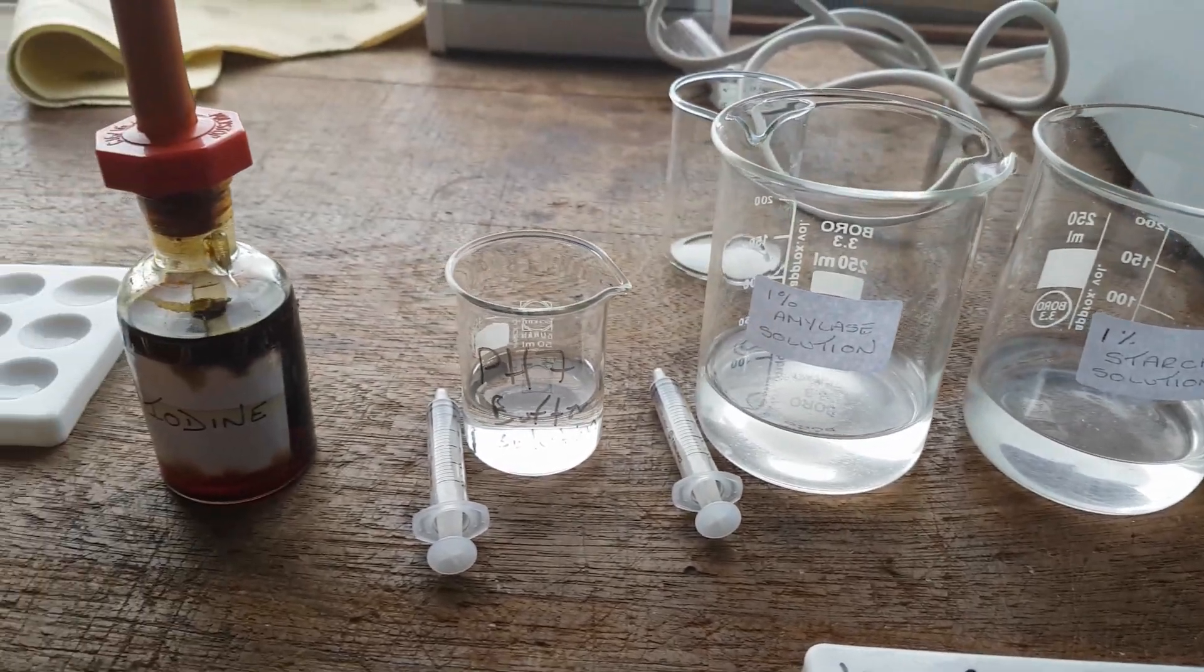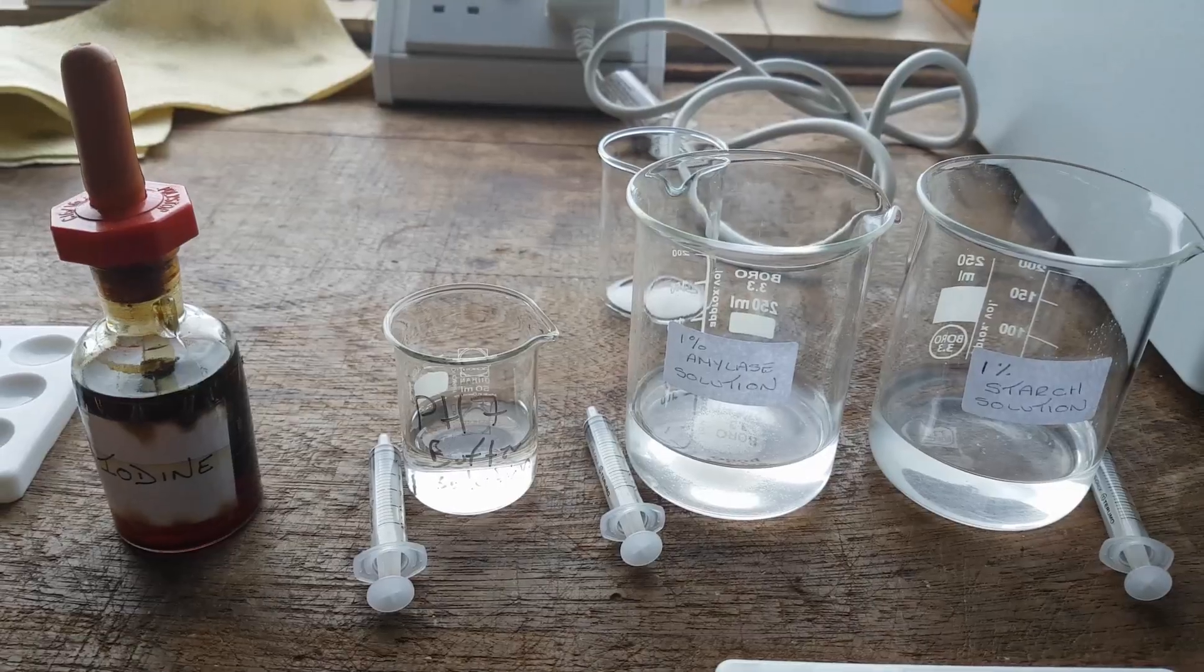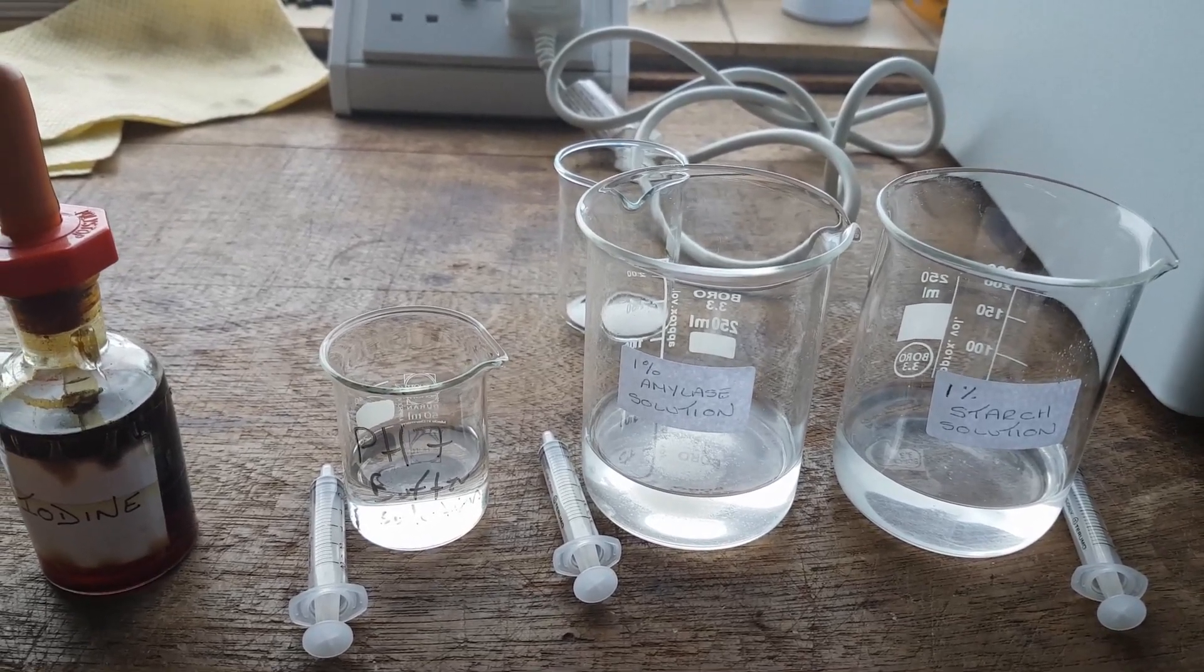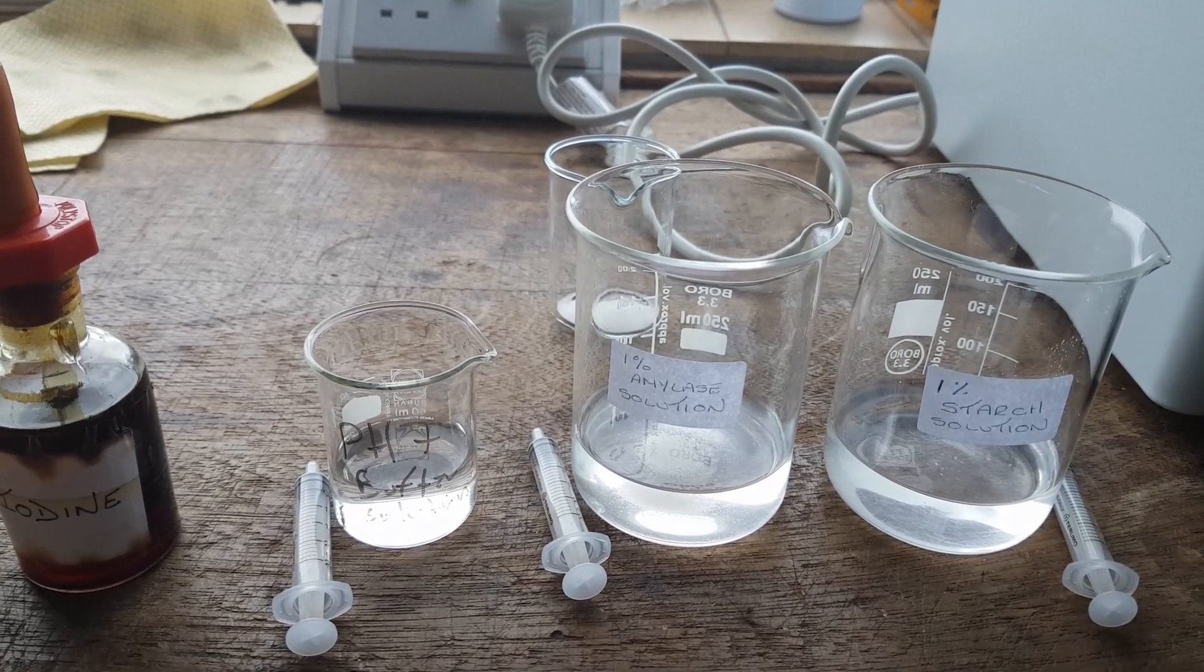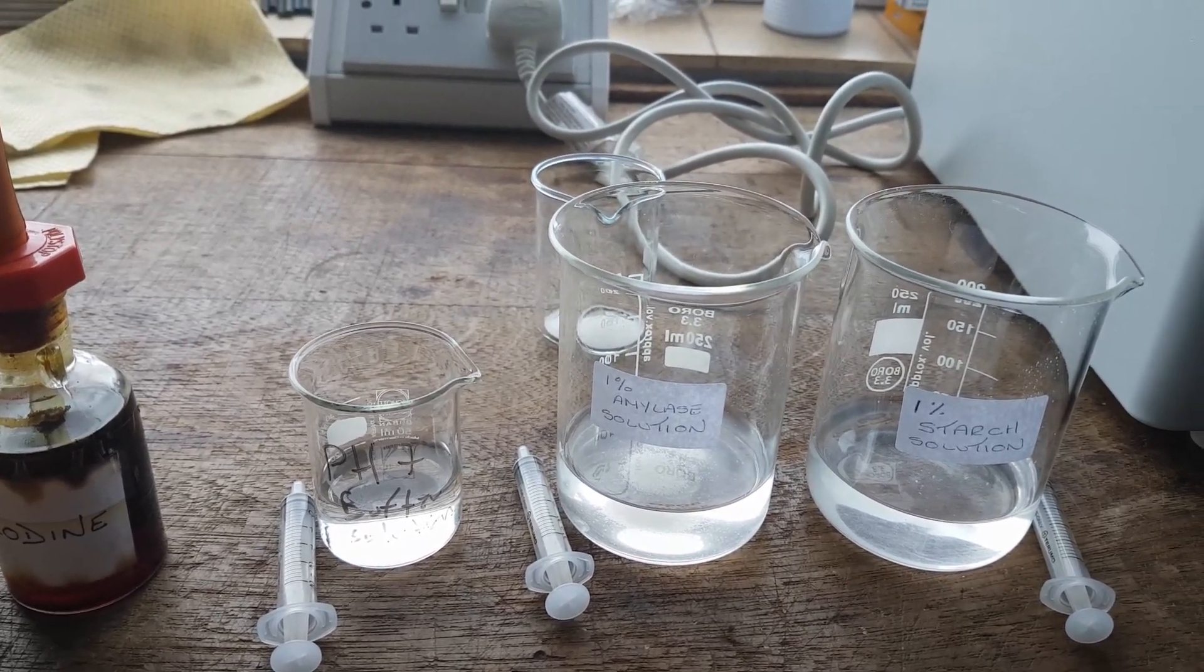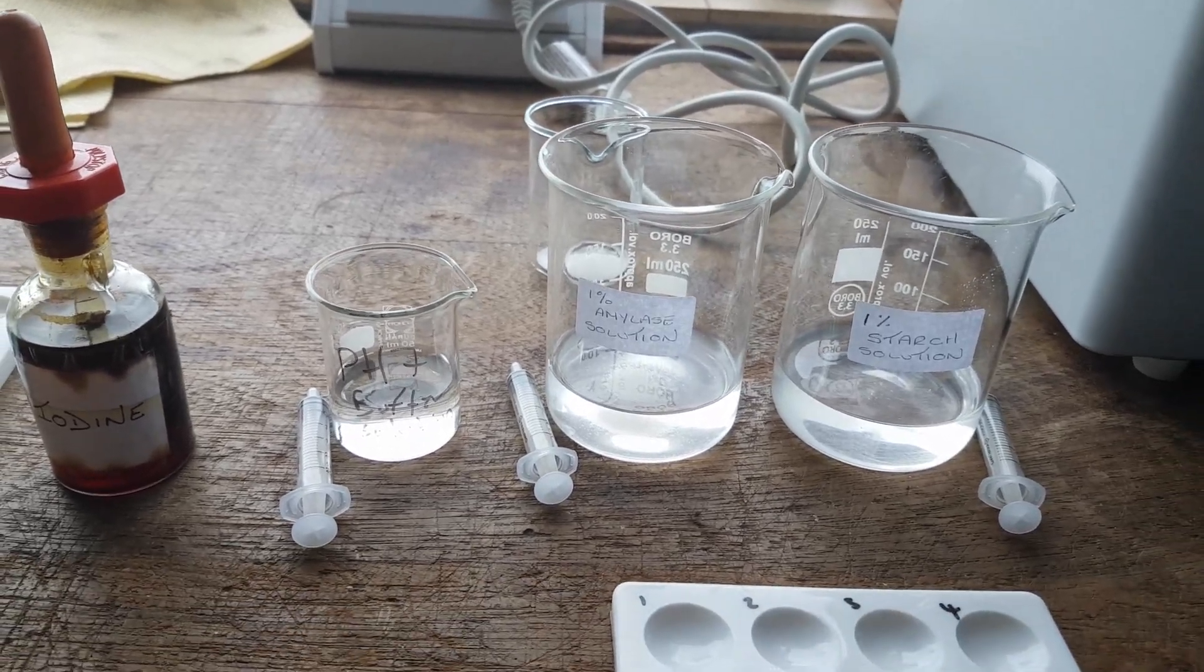Now, the whole point of this experiment is that iodine is an indicator for starch. So in other words, if you have starch and you place iodine into it, the iodine will turn blue-black color. I'm going to show you what a negative result looks like and then show you what a positive result looks like.